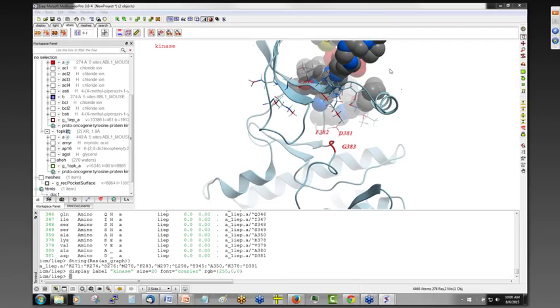Had a question about the optimal size for particular figures. I will send out a link which requires the command line to interact with. Basically, for high quality images, you need these selected, and then you can set anti-aliasing here. But to define a number of dots per pixel resolution and so on, you need to use the command line. I'll send that out.